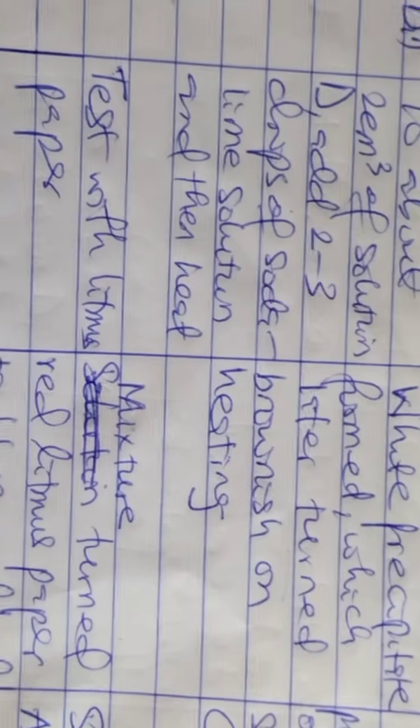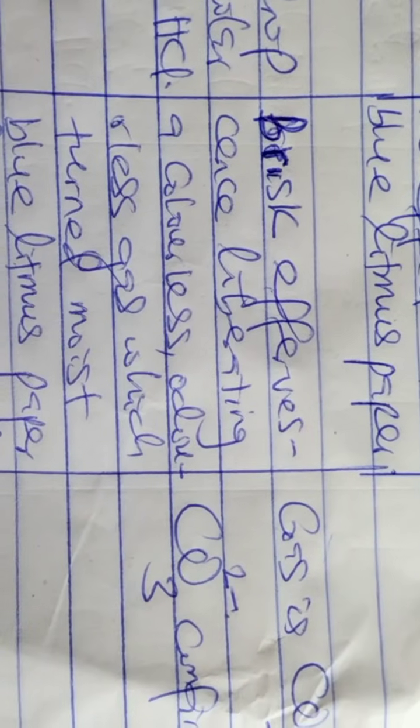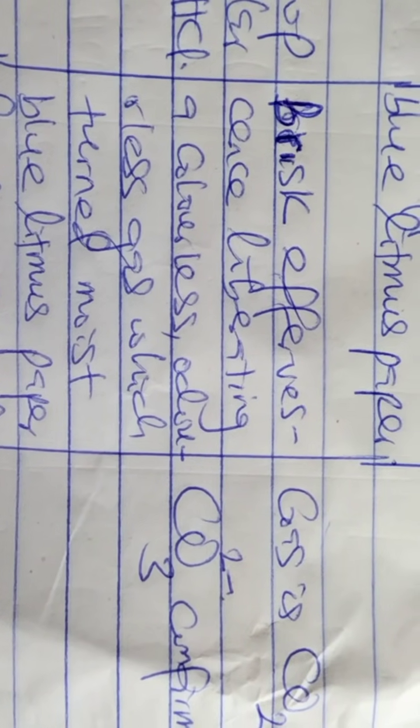Then we also have a command on the test column that says you also add a drop of 2 molar solution of HCl to the above mixture of D and soda lime. You add HCl. So when you add this, you're going to observe brisk effervescence, or you can say rapid, but that brisk or rapid should be there.